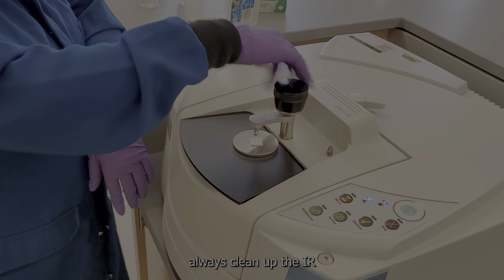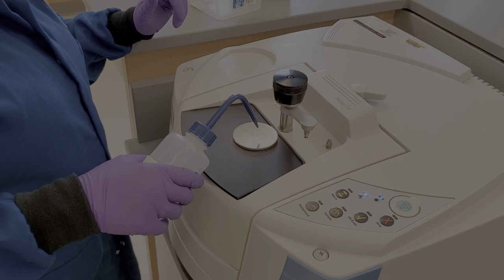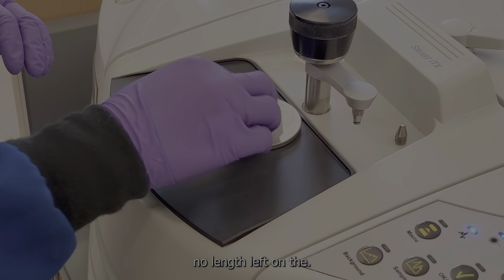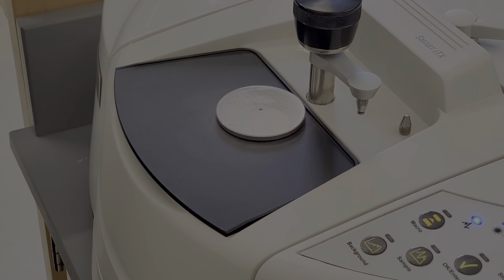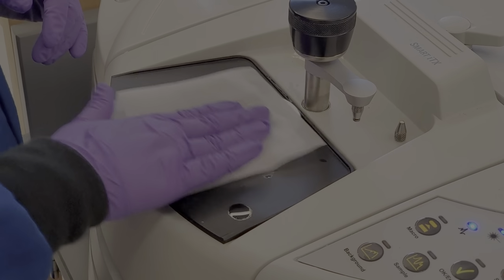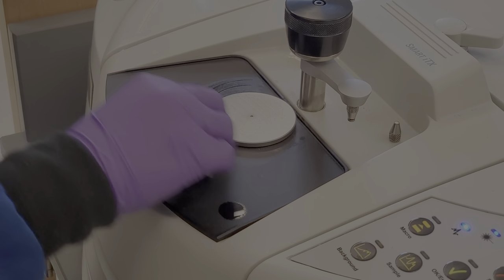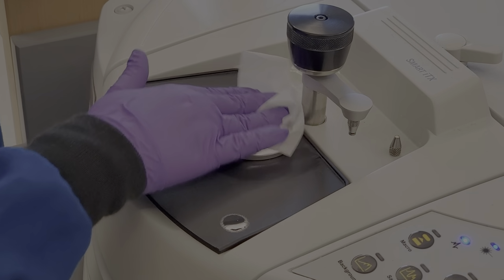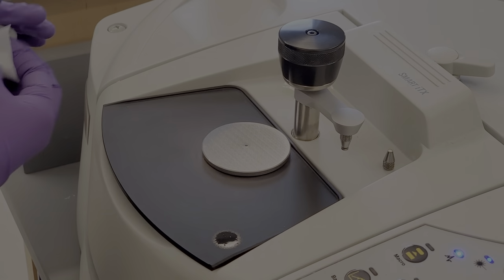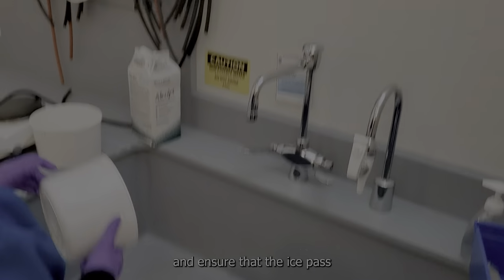Once you're done collecting your data, always clean up the IR. You would use either isopropanol or methanol to clean up the product that is on the pedestal, and always use Kimwipes to ensure that there is no lint left on the pedestal. Once you're finished with the IR, proceed to clean up the rest of your reaction. The first thing is dumping the ice bath. As long as nothing is spilled in, you can dump the water down the sink and ensure that the ice bath is put back to dry.